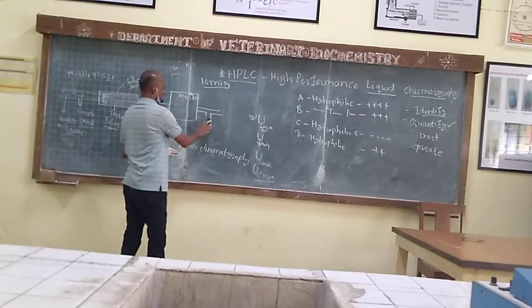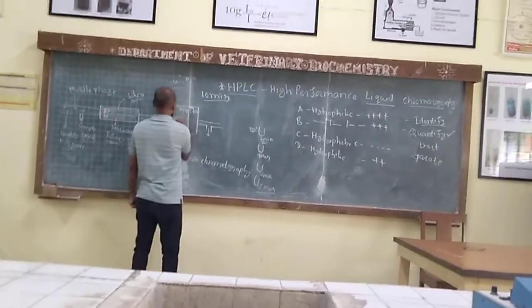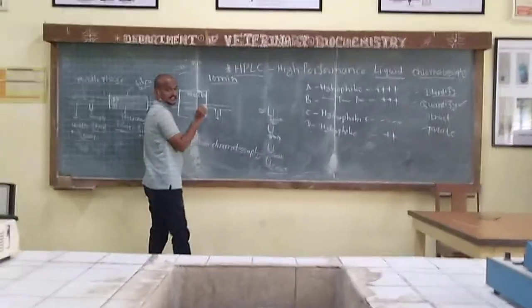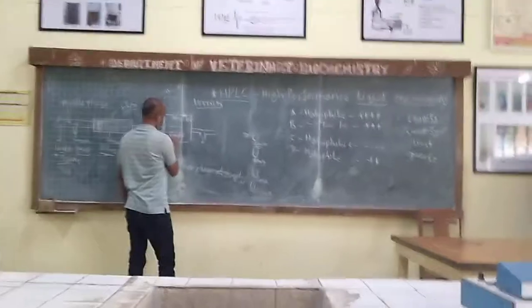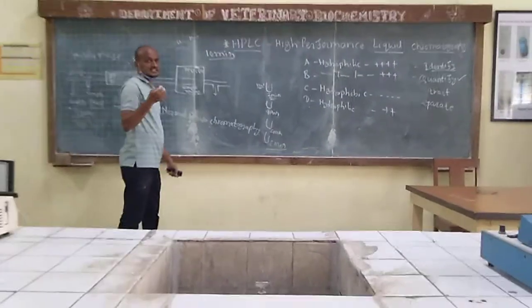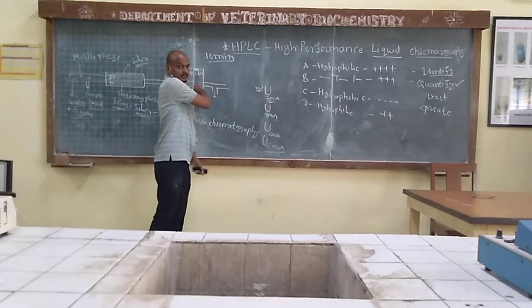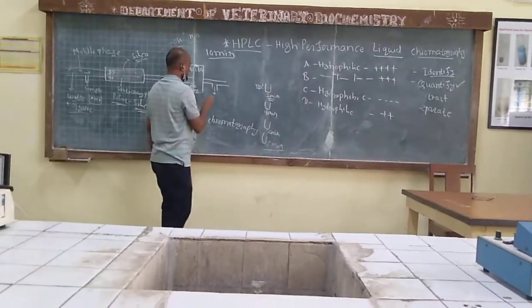Okay, so we have collected sample from here. Okay, sample collection. Reading. Here sample reading is done, right? Detection. Sample reading. So identifying which sample is there has been done by a UV absorption based principle detector. Okay, one simple detector we have seen.